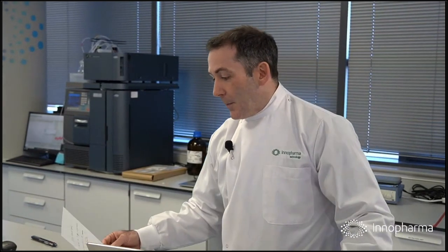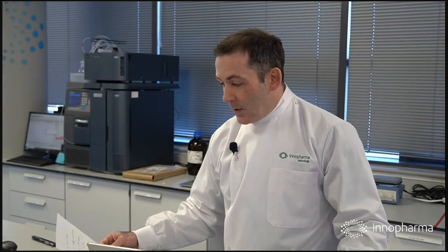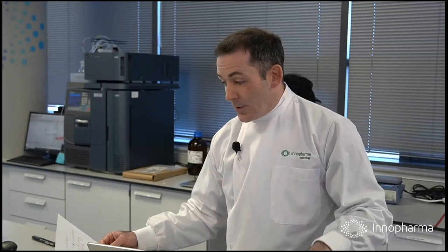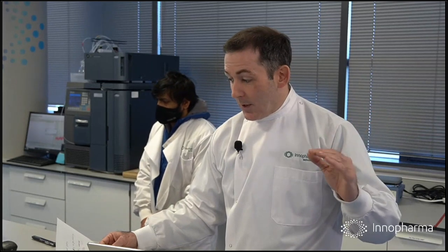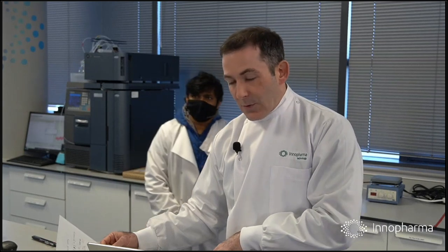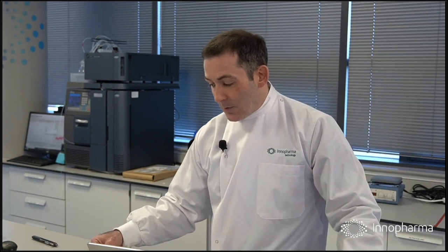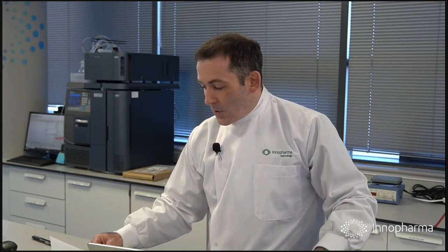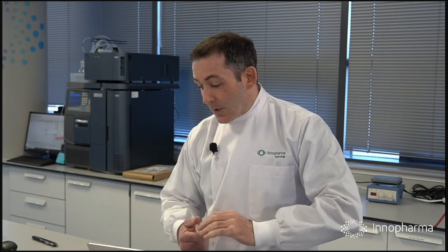So our yield was in fact 23.5 grams of the filtered crystals, which we showed you earlier, having started at 31.4 grams. So we could see that the concentration prediction agreed extremely well there. The final temperature being 5 degrees and the solubility at 5 degrees being 5.7 grams, our final concentration was approximately 5 grams.